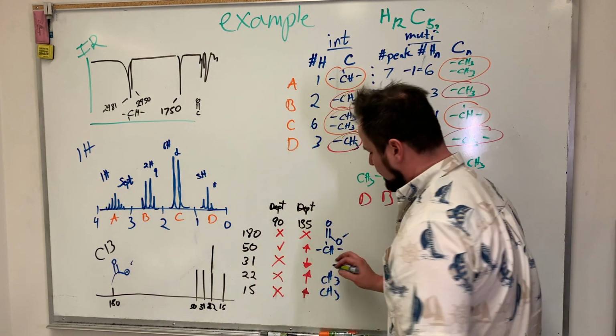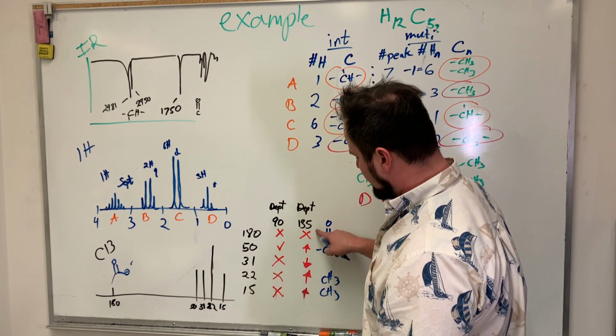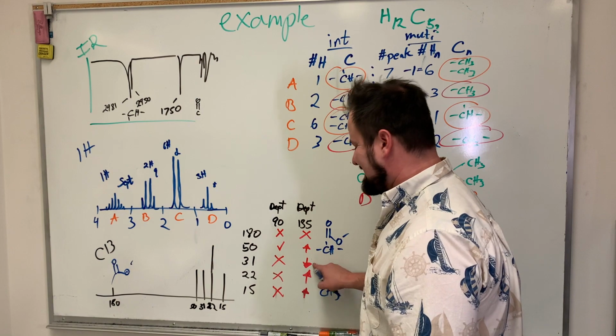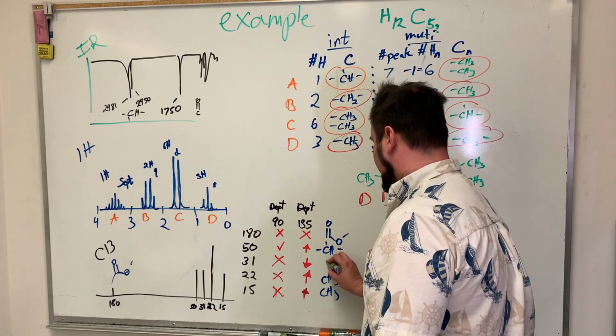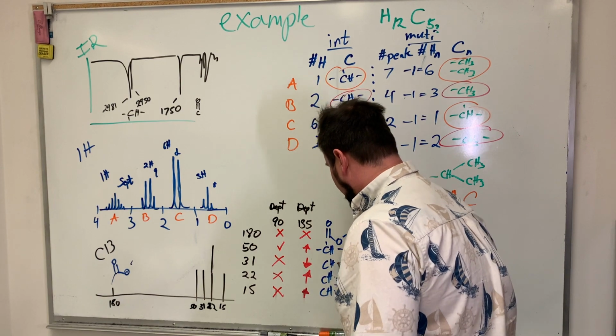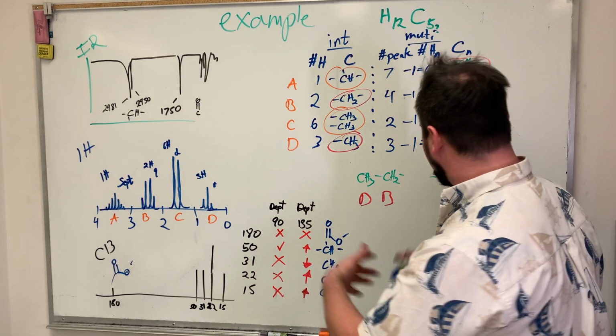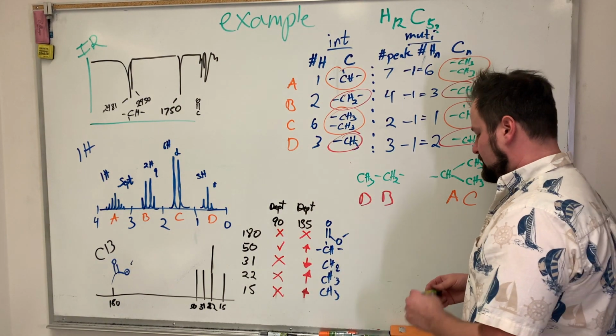That's these ones here, and this one in the middle, because it's down for DEPT 135, that should be a CH2. Yep, I wrote 3. This should be a CH2. Now, that should tell us already, most likely, where these are going to be.